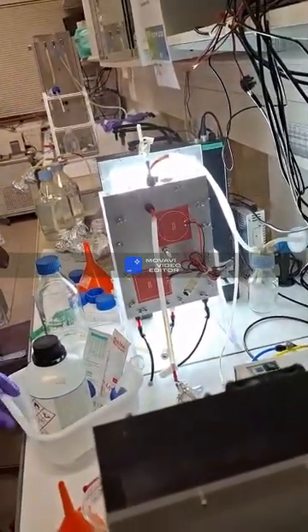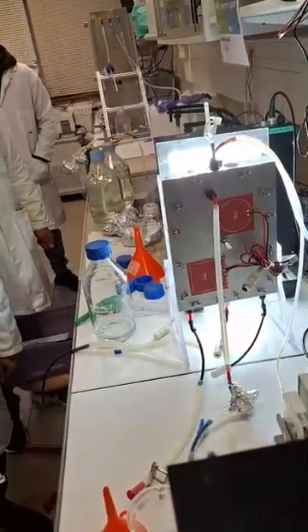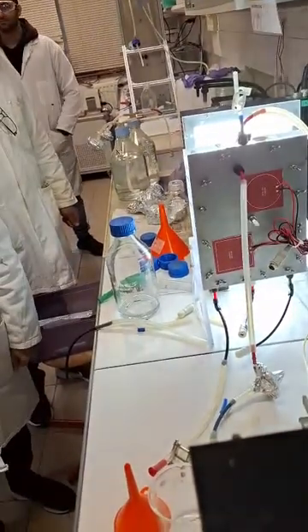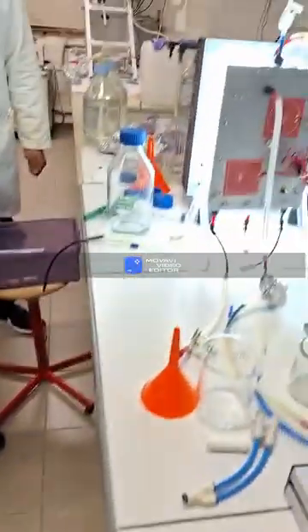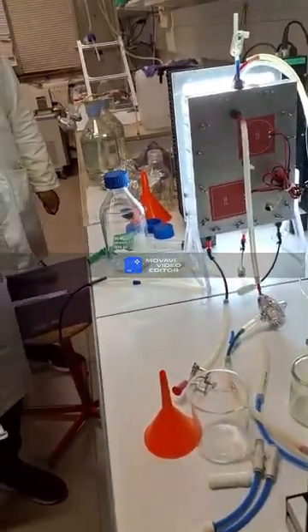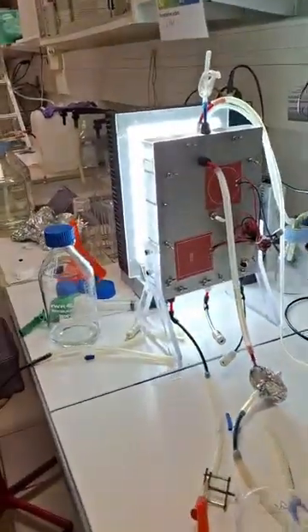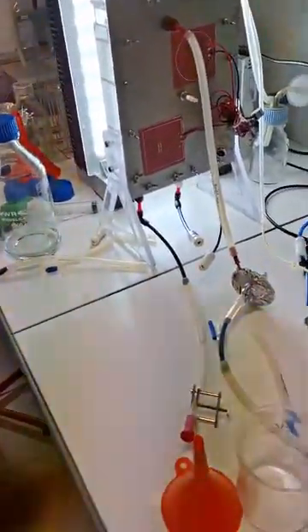And now I put this here. If you want, you can take just one tube. It's a gift. It's the solution for calibration, the probe calibration, if you want to take one. And we will use it to calibrate.